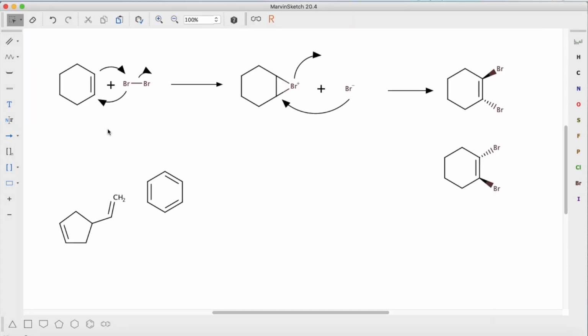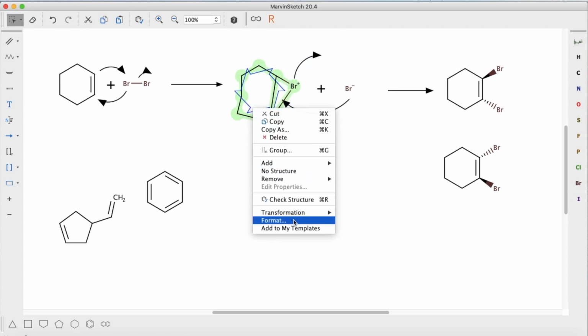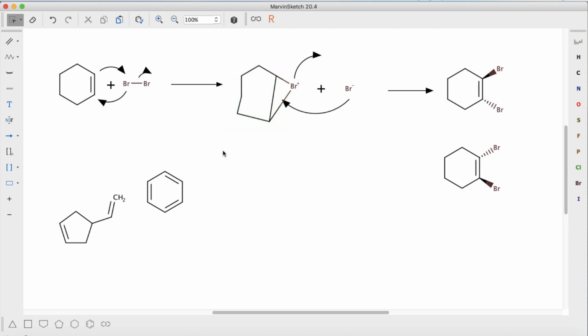Another cool feature on MarvinSketch is that you can actually highlight your compound and go to the top there, and you can actually find your chemicals. And so instead of having to copy and paste the name, you can just highlight your compound and it'll do an online search for you. Let me fix the structure, and there you go.